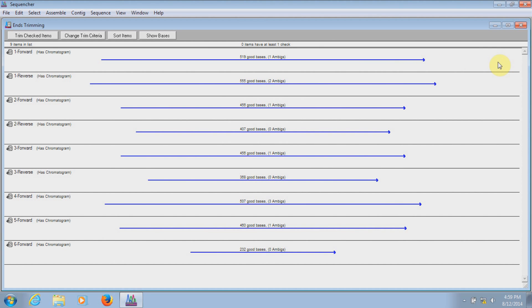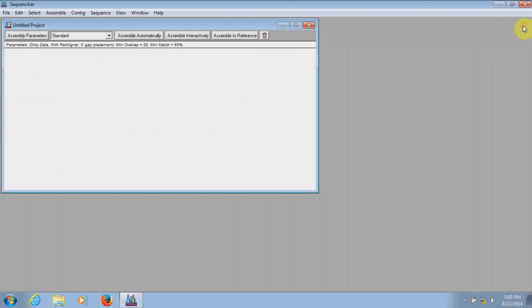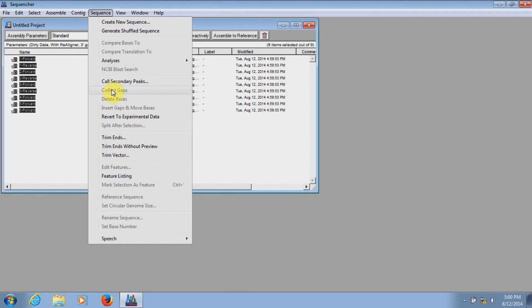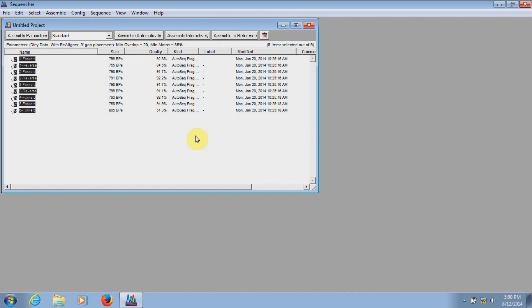Now, what happens if after you've done this, you suddenly realize that was maybe more than I wanted to trim off of these sequences. Maybe I should have taken a little less off. That's not a problem. When you trim the data, Sequencher keeps a copy of the original sequences. So all you have to do is go to Sequence, Revert to Experimental Data, and now the sequences are the original sequences with those bits that we trimmed off back on them.